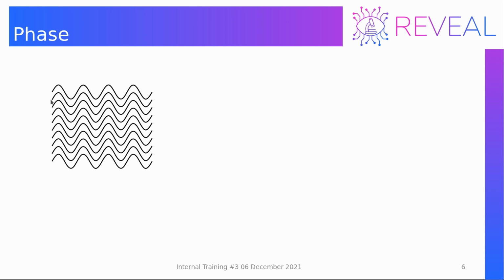So up to now I was describing a single sine wave. In microscopy we don't work with single waves. We work with whole light beams that consist of multiple waves. So let's create more waves, and let's distribute them so that the peaks are aligned.